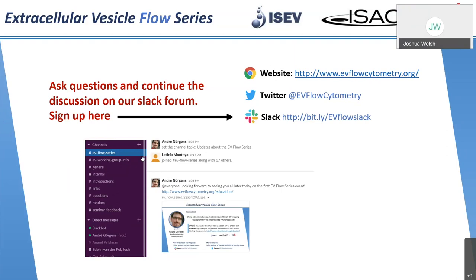So we have another multiplex question asking if you've tested different isolations and see differences in profiles, and also if you've tested biological fluids like serum and plasma, and if you've tested those, do you see lots of non-specific binding?